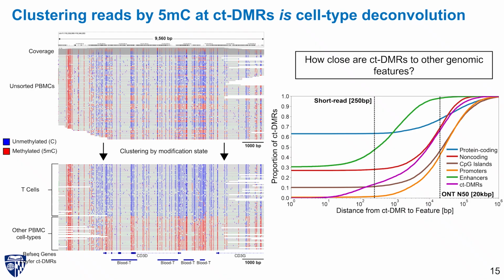Because all too often, we're not taking our samples that we're getting from human tissues or mouse tissues or animals and flow sorting them carefully into single cell bins. Instead, we're just sequencing it in bulk. And so what I'm arguing is that we can later deconvolve out and see which reads belong to which cell type, and then see, maybe I got somatic mutations that arose only in this cell type or only in that cell type.